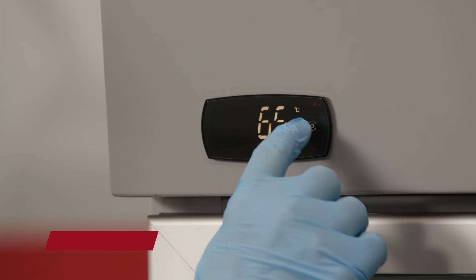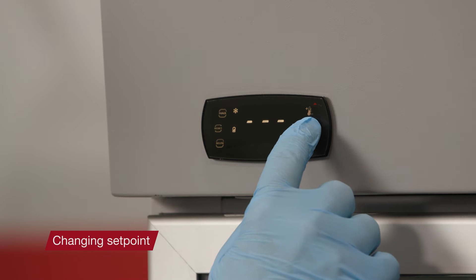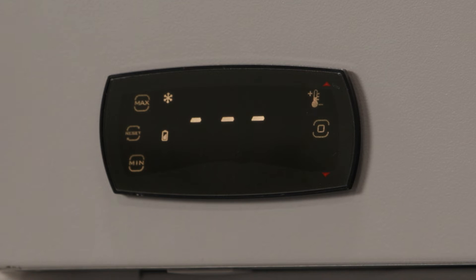In order to change the temperature setpoint, press and hold the program button for three seconds. When three dashes appear, the control panel has changed to direct access mode.